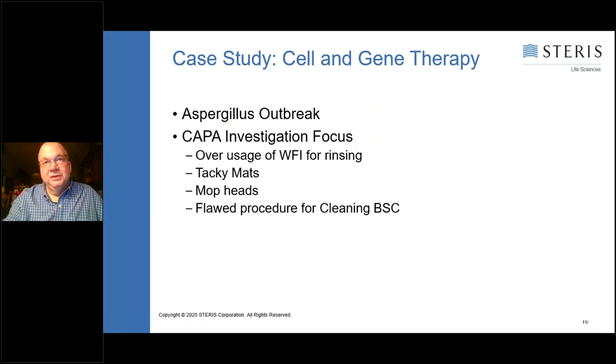So I've been involved with a number of issues in the industry, and one of them recently involved an ATMP, which is a cell and gene therapy facility, where they were having an Aspergillus outbreak. And both myself and a colleague of mine from ValSource worked with this customer. In their CAPA investigation, they were finding very high mold counts all over the clean room in the cell and gene therapy site, from Aspergillus.